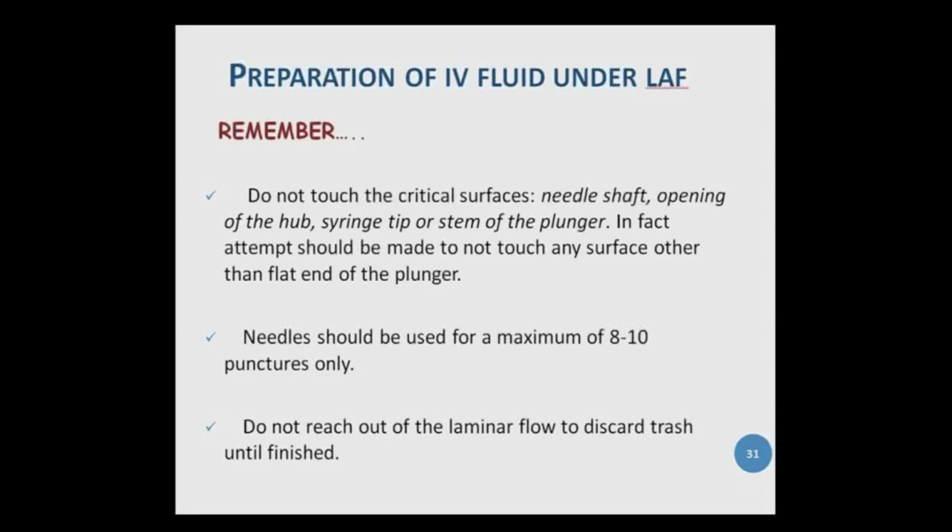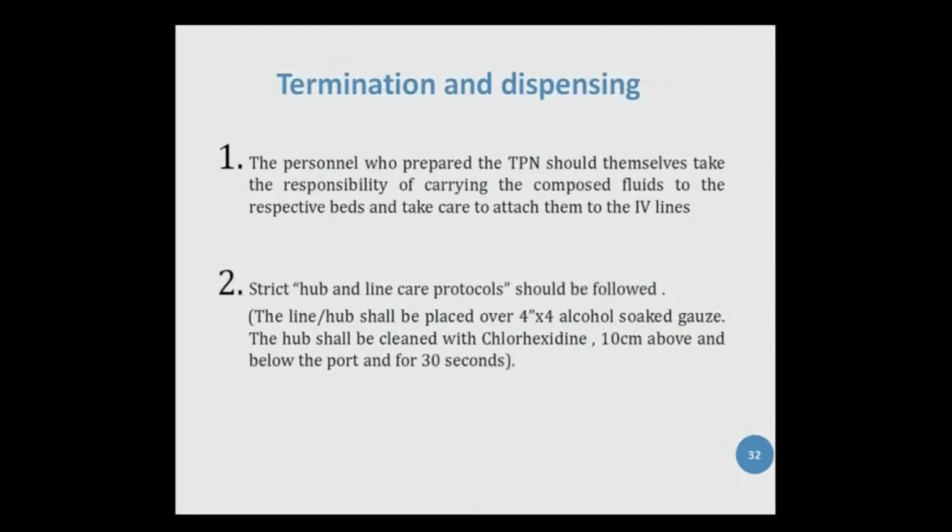Needles should be used for a maximum of only 8 to 10 punctures. Do not, we repeat, do not reach out of the laminar flow to discard the trash until finished. It is a good practice to use a bowl in which the extra fluid or the used needles can be discarded and kept within the laminar flow.